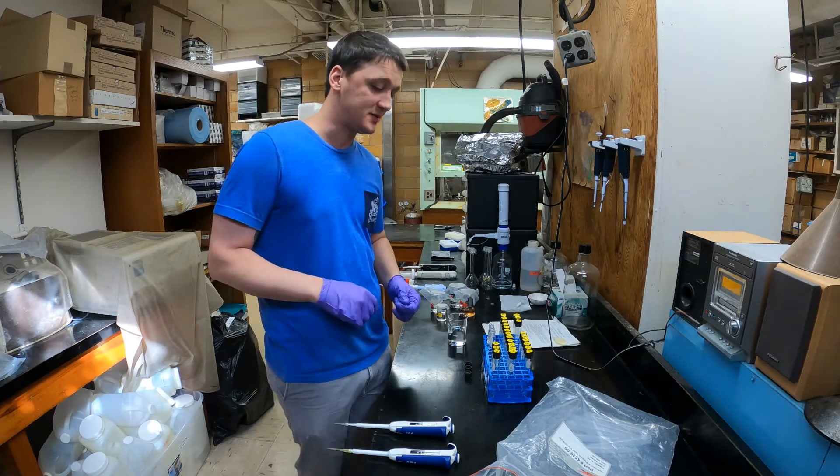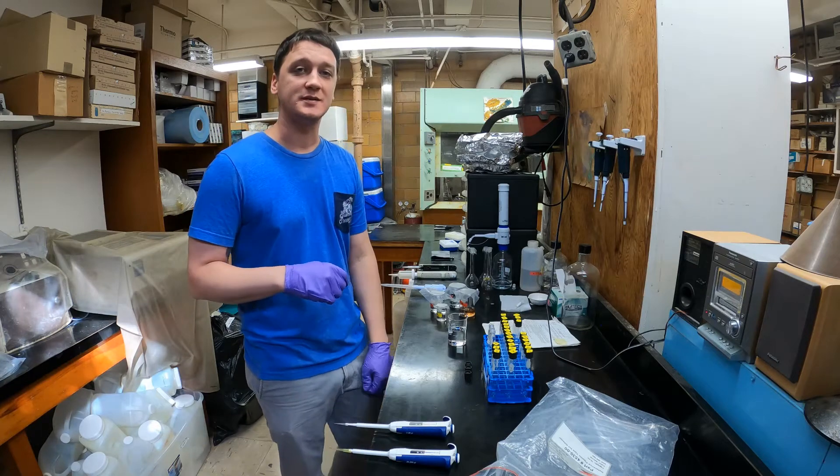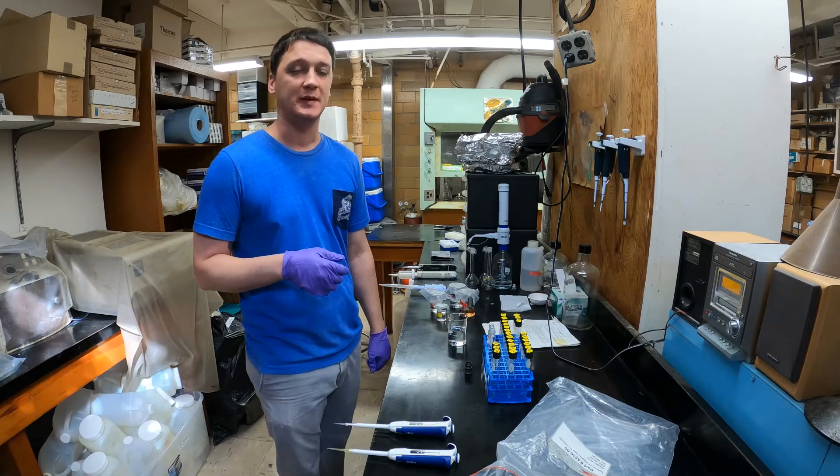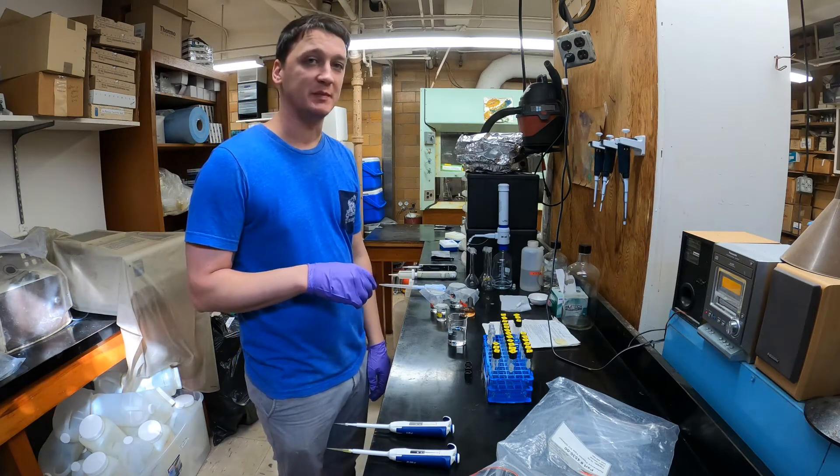Hi everyone. Today I'm going to show you how to do an ammonium analysis by hand. You can also use the auto analyzer like we'll see for the nitrate analysis during this lab, but it's pretty easy to do this ammonium analysis by hand.